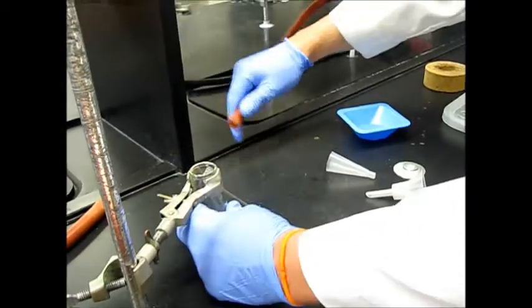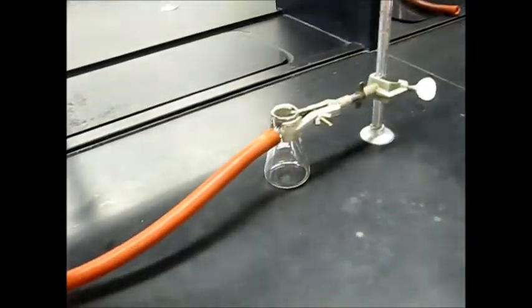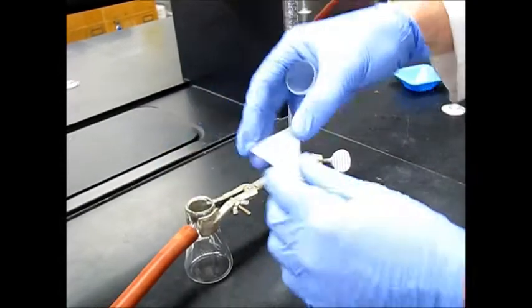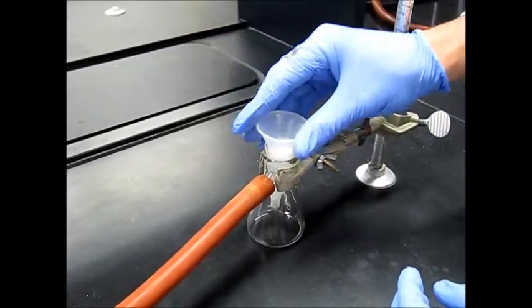We're going to spin it around and attach our vacuum right here. Cool. The vacuum filtration that we're going to be using is a Hirsch funnel. This is called a Hirsch funnel adapter. It's just to make sure that we get a good seal into this Erlenmeyer flask. So we'll go just like that.